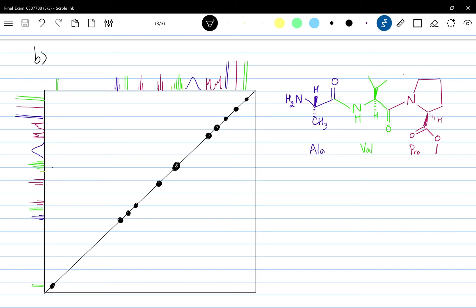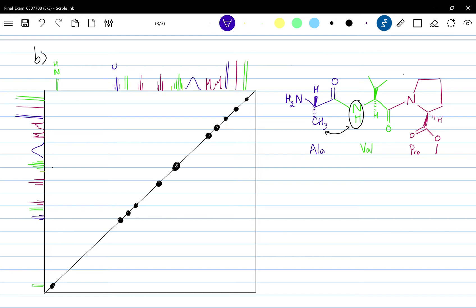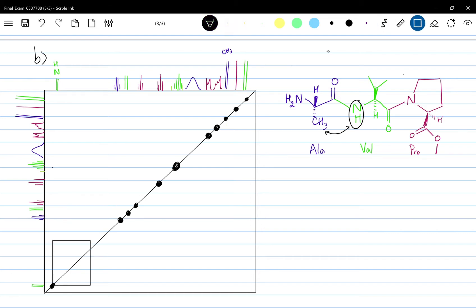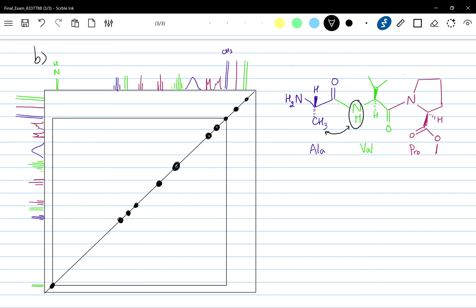First we'll focus on this NH peak. This NH proton corresponds to this doublet you see on the downfield of the proton spectrum. If we excite this proton, we can see the interaction between this proton and H3 — the methyl of alanine — and this will give us this peak here, therefore giving these two spots. This is the first interaction.